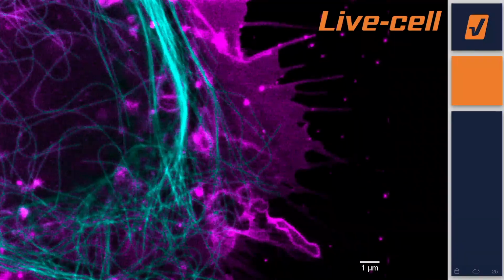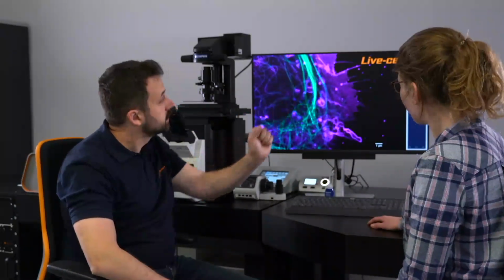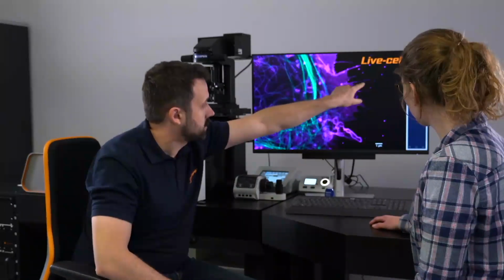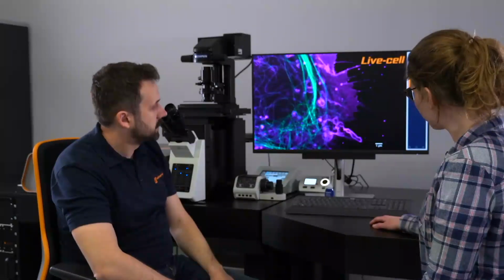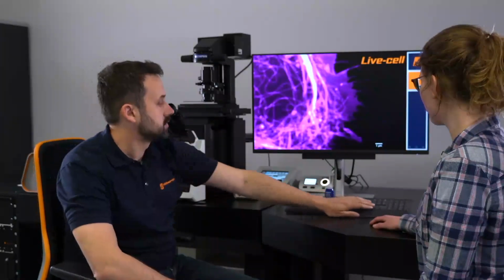Yeah, I would say so. I can definitely see some extra structures now in the membrane stain. I would say up here, I can definitely see 2 structures instead of 1. And I think the projections are also far better delineated here. And of course, the tubulin appears here as single tubules rather than, say, one big blob here. So I think, yeah, makes a good difference here.